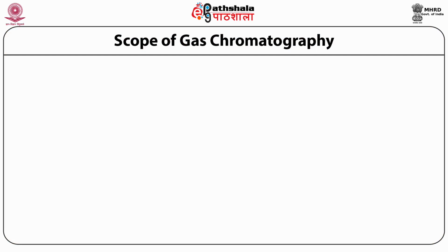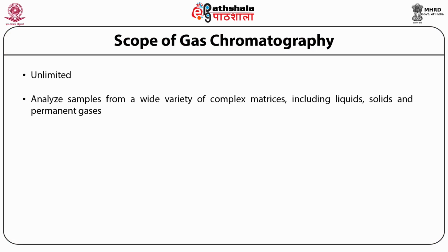The scope of gas chromatography is unlimited. We can analyze a wide variety of samples of complex nature, including liquids, solids, and permanent gases.